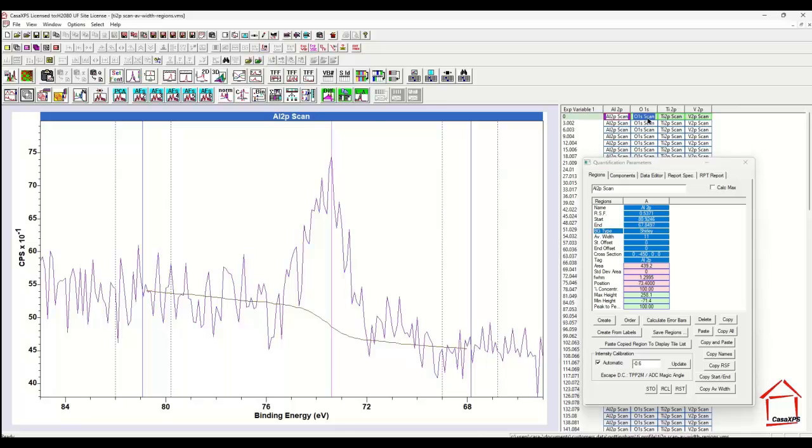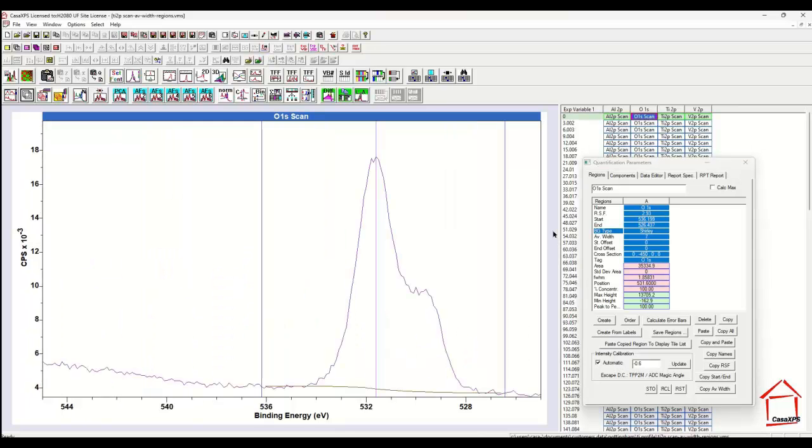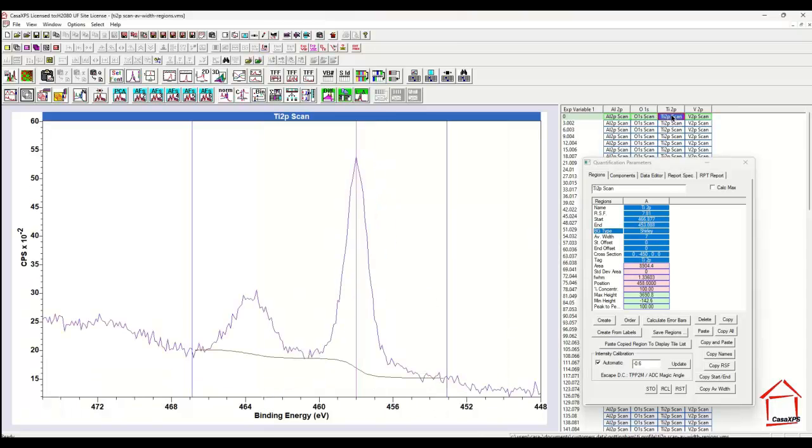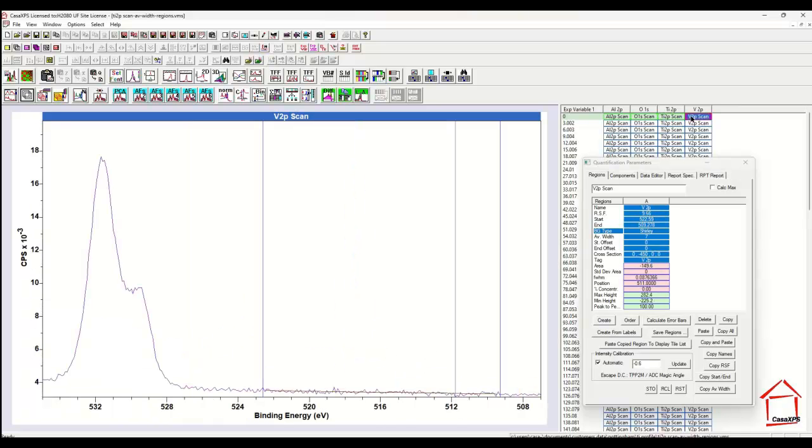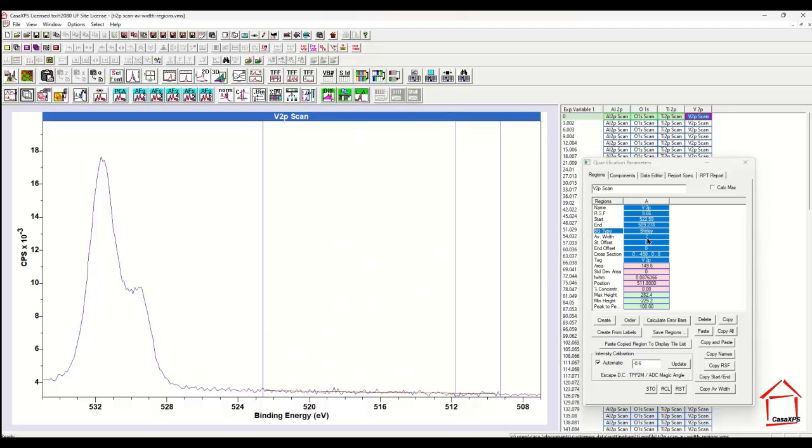That's not necessarily the case that you always have to have a large average width. Here we have much better signal to noise in the oxygen, reasonable signal to noise in the titanium, and virtually no signal in the vanadium at this point. But at some point in the profile, vanadium will appear.